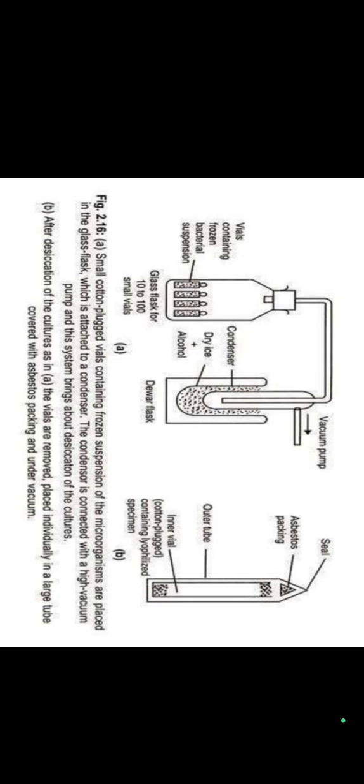Then next one is lyophilization or freeze drying. Freeze drying is a process where water and other solvents are removed from the frozen product via sublimation. Sublimation occurs when a frozen liquid goes directly to a gaseous state without entering a liquid phase. It is recommended to use slow rates of cooling, as this will result in formation of vertical ice crystal structures, thus allowing for more efficient water sublimation for frozen products.